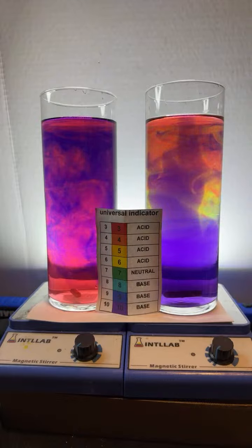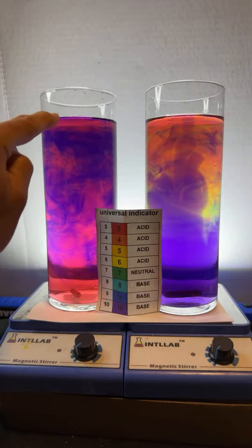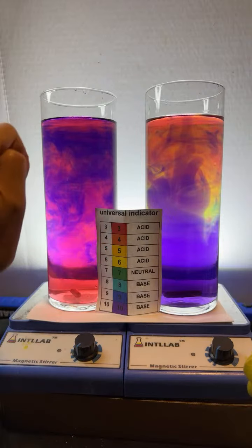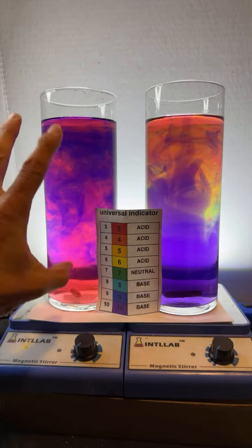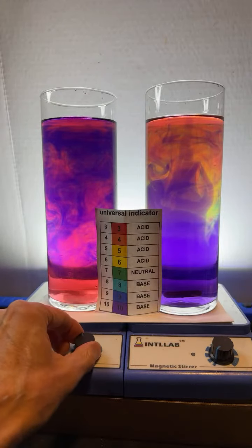Okay, what does pH mean? As someone says, it means mathematically the negative log base 10 of the proton concentration. Okay, here we go. We're going to mix these up. And when I mix these up, if there's more acid than base, this will be red, orange, or yellow. If there are equal amounts, it'll be green. And if there's more base than acid, it'll be aqua, blue, or violet. Here we go. Let's mix that up.